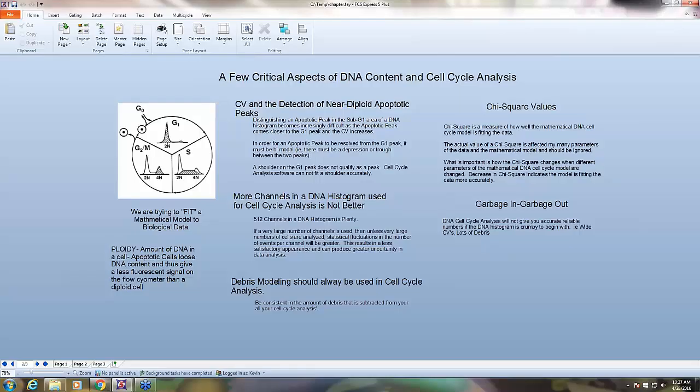Okay. So I have here a couple points about doing cell cycle analysis, which I thought that I would just go over first, because the way that Sean gave his presentation, it looks really fun. It looks really easy, and it's very powerful in FCS Express. But as we well know, very often reality doesn't look as good as when we do one of these presentations.